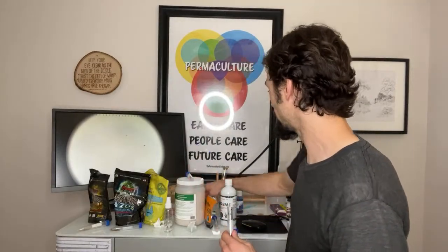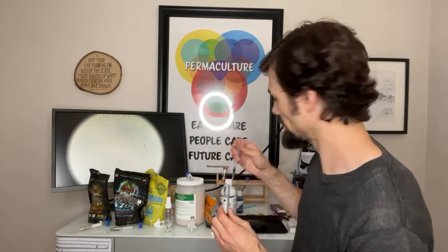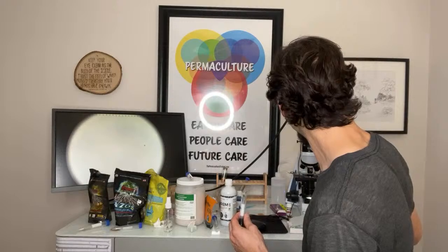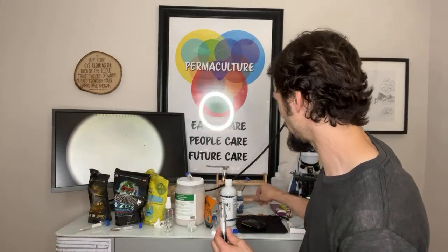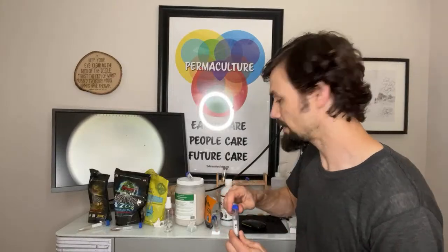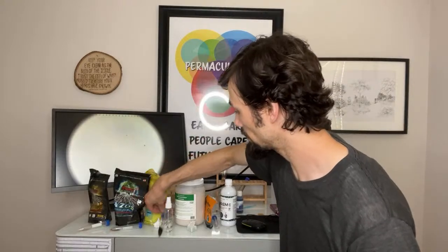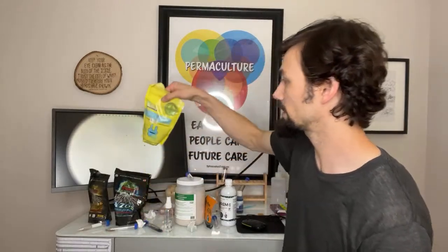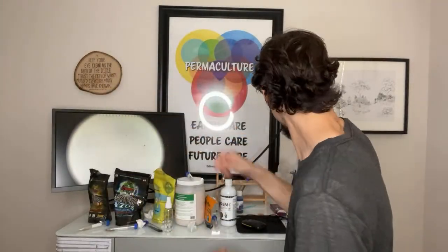I'm just gonna do this. We're just gonna start. But basically, all that stuff about the excitation and emission is very simple. And fungi has a very specific excitation and emission autofluorescence. So this is Recharge. A lot of people like this. Let's just see what it looks like.